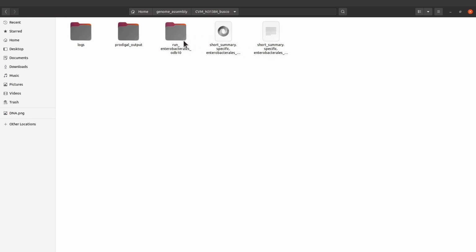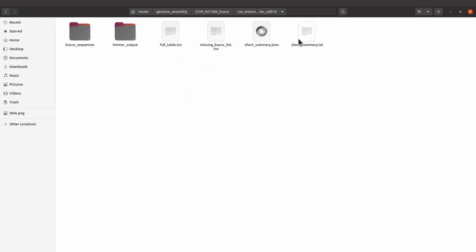A detailed explanation of all these outputs will not be done in this video, but I'll make other tutorials and try to explain these things. So we have a short summary here. You can open it. This is the TXT file. We also have a JSON file, and we also have this one here. I'll open this one. Here we still have summaries, but I would like us to check this full table. This has details of the results.